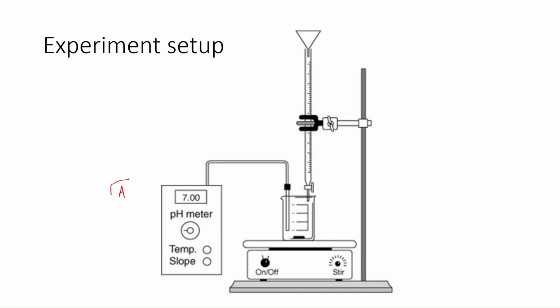It might change it even more than 0.5. That's okay. There's nothing you can do about that. Just record whatever pH you got after that drop, and you can add that into your graph. Sometimes you'll add multiple drops of your titrant and you won't see a big change in your pH, and that's okay too. You can just measure the volume that you've dispensed every 1/2 of a pH unit, or as close as you can get.